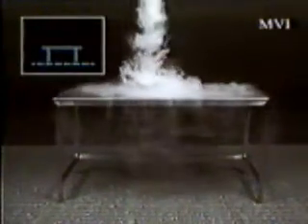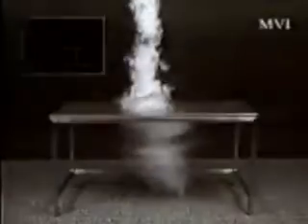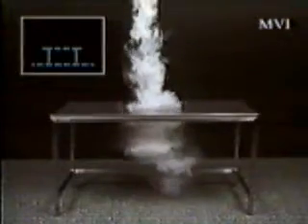When a perforated worktop is used, but still with a solid floor under the same configuration, air passes through the worktop, but this creates a vortex beneath the work surface. A solid worktop on perforated floor creates a mass of disturbed air on the working surface, but there's improved carry-away under the worktop, even though a vortex of turbulence is still created. The effect of perforated worktop on perforated floor needs no comment.